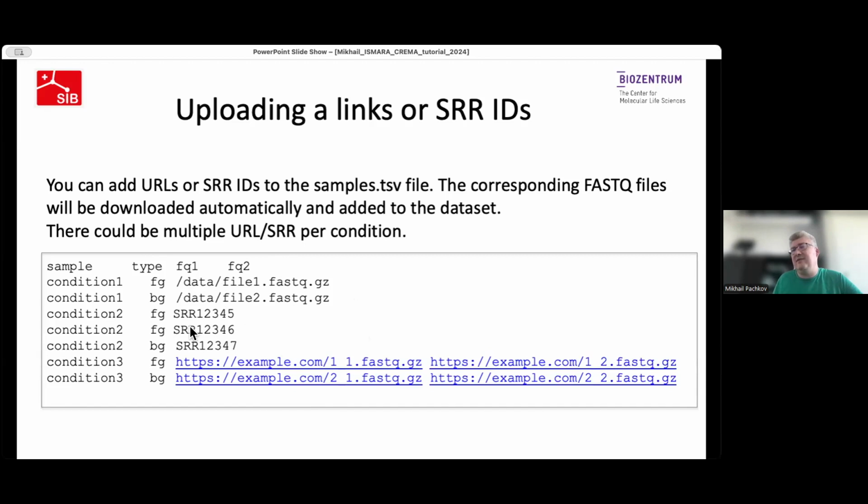Moreover, with this file format, it's actually possible even to mix different types of data. So you can upload, for example, only 2 FASTQ files, and the rest you would like to obtain from a database. So it's all going to be done automatically on the CREMA server, downloading things first from the database and then from the internet links.